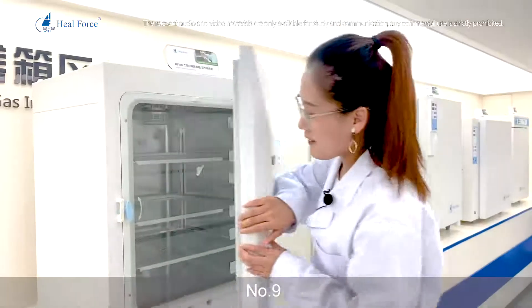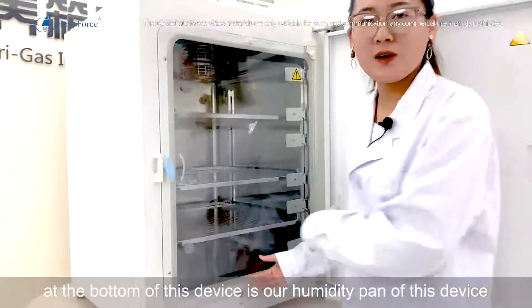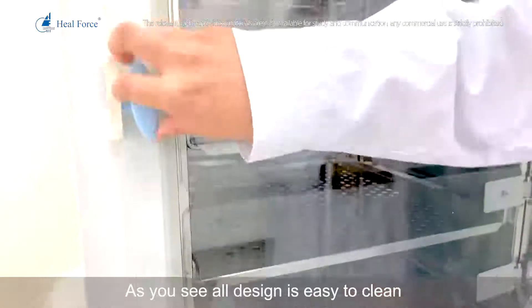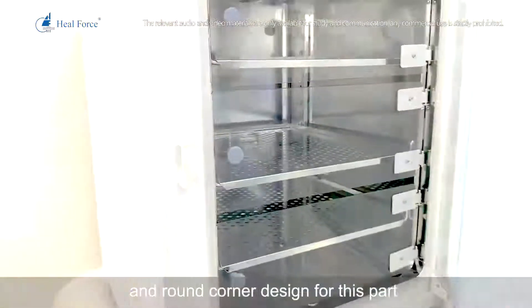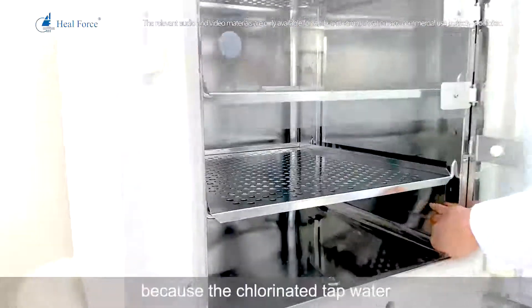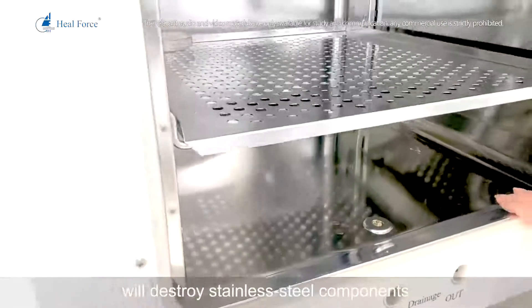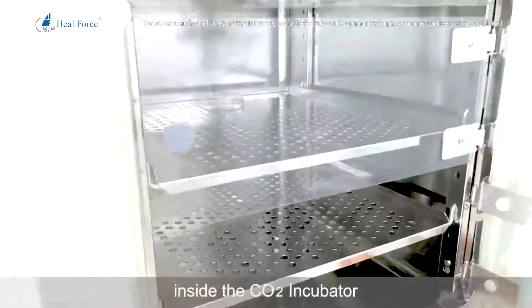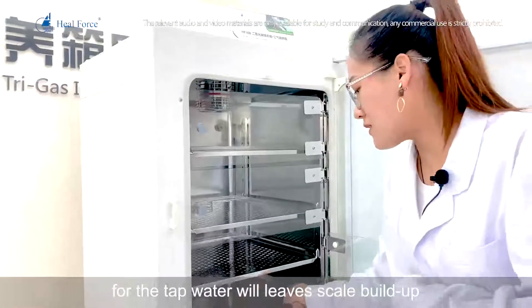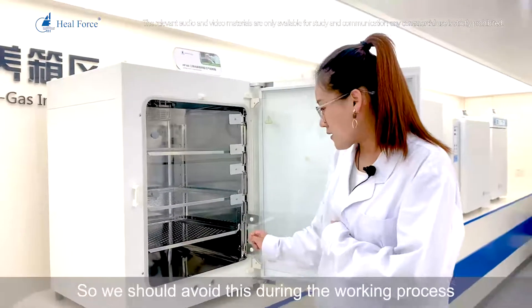Number 9: at the bottom of the device is the humidity pan, designed with round corners for easy cleaning. Never add chlorinated tap water directly to this pan, because chlorinated tap water will corrode the stainless steel components inside the carbon dioxide incubator. Additionally, tap water will leave scale build-up inside the humidity pan, so always avoid using tap water during operation.